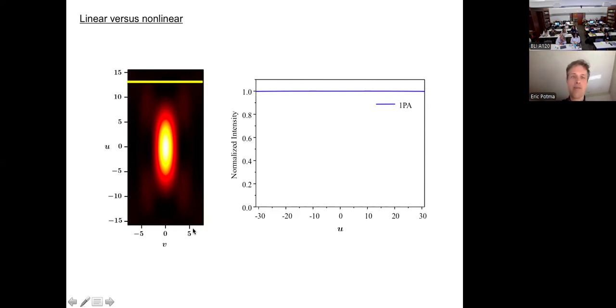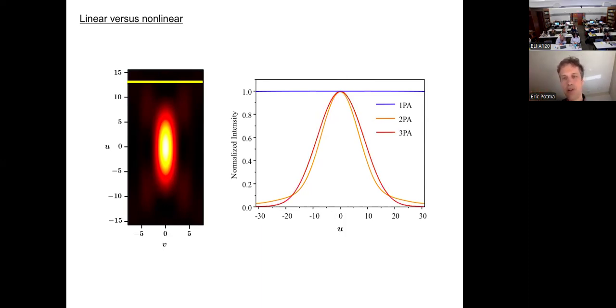Okay? Now, if I do the same thing for 2 photon, I see this. So for 2 photon, clearly it makes a difference, because here the excitation density is the highest, and because it depends non-linearly on the incoming fields, it actually peaks around 0, because there the concentration of light is the highest, and the square is way higher than the square below it. All right, so you see here that 2 photon excitation has actually intrinsic depth sectioning that the 1 photon doesn't have.